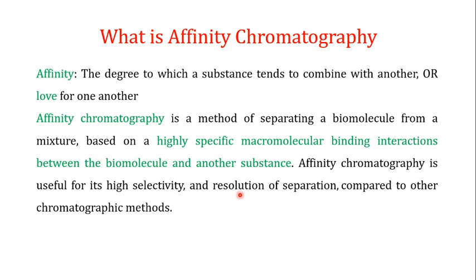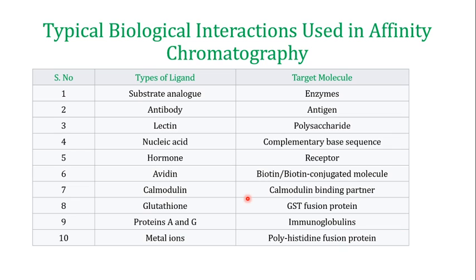Affinity chromatography is very useful for its higher selectivity and resolution of separation when you compare it with other chromatographic techniques, and these are its advantages: high selectivity and high resolution power of separation.